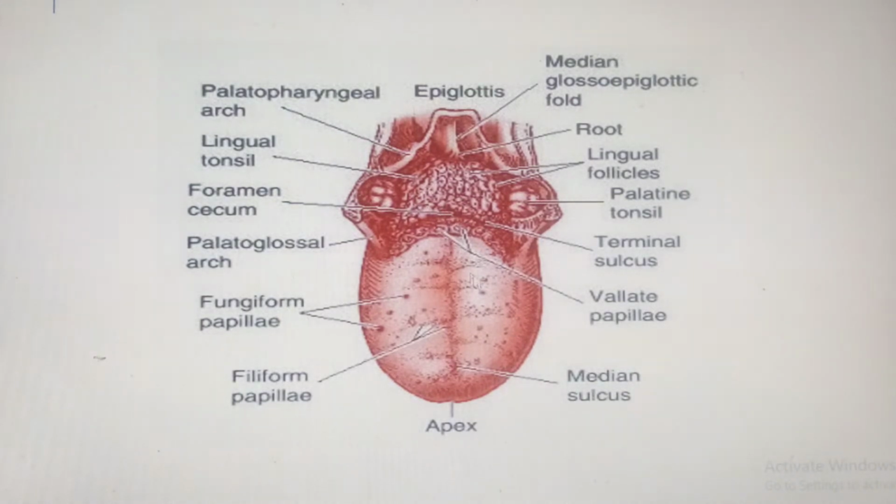Now if I look at the dorsum of the tongue, I see other papillae, apart from these very rounded large papillae just anterior to the sulcus terminalis, in the anterior two-thirds of the tongue, being the vallate or circumvallate papillae. What we find is that we have other papillae over here. We call them primary papillae, because even within them we will have other papillae developing, which will be secondary papillae. I'll show you that. So these ones you find over here are the fungiform papillae.